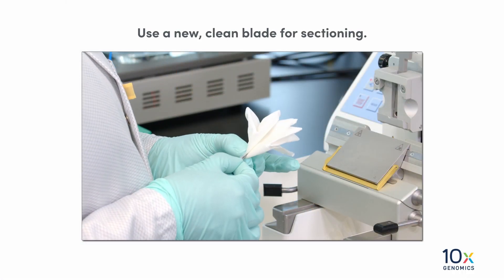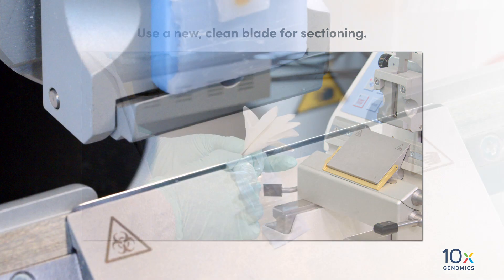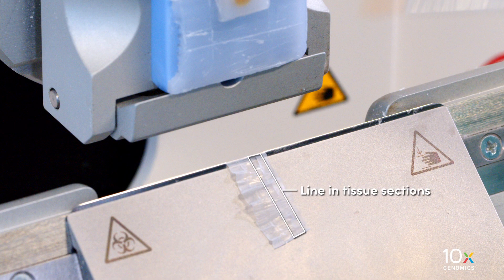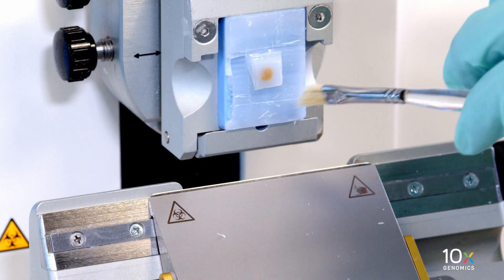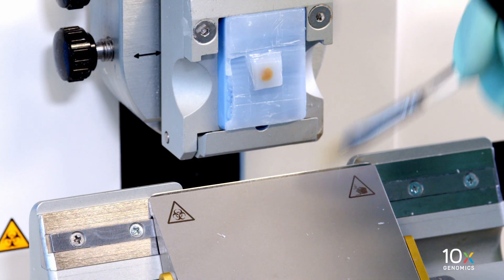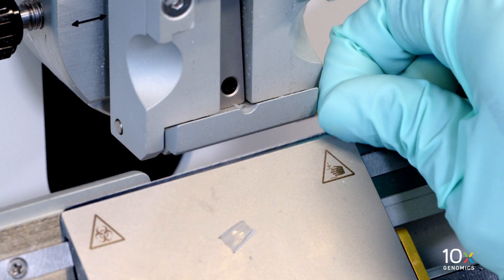Use a new clean blade for sectioning. If a line appears in the tissue sections, clean off the blade, tissue block, and sectioning area, or replace the blade.